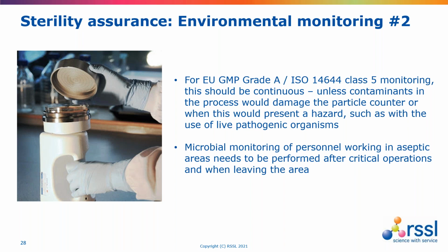And that may include participation in a media simulation study. And the media simulation study also represents an important part of the environmental controls as well, because it will assess the robustness of the process and all of the steps involved to ensure that the product can be filled under controlled conditions.